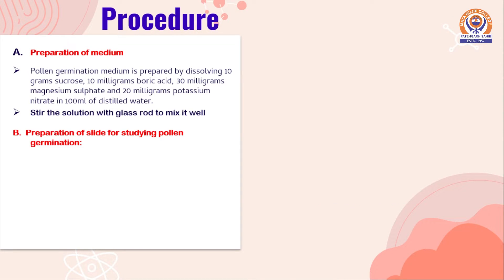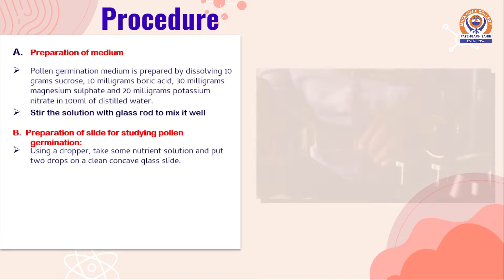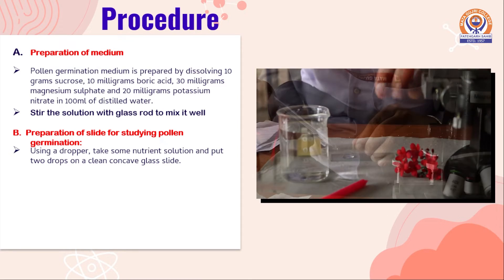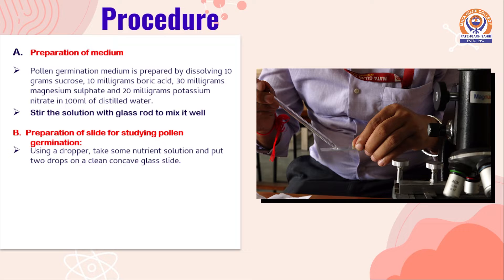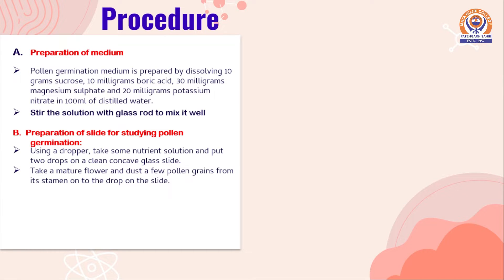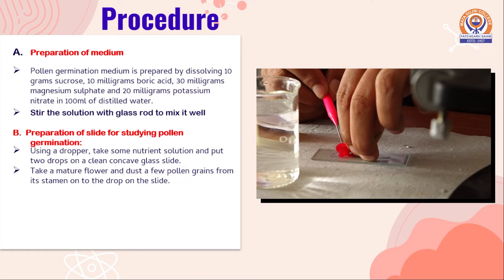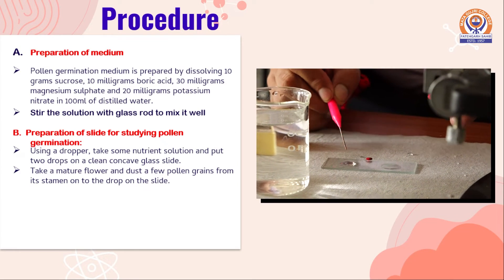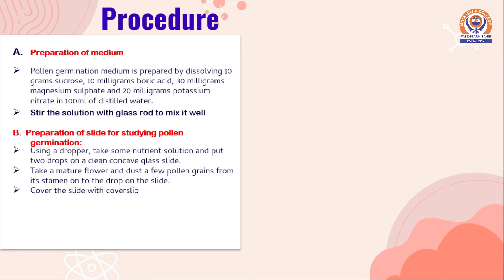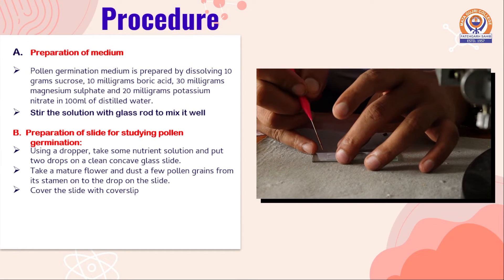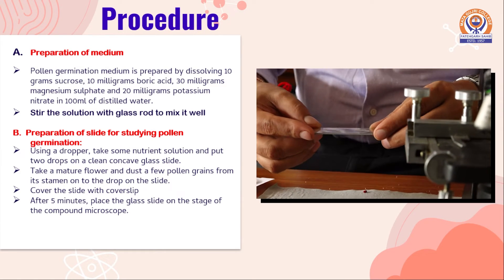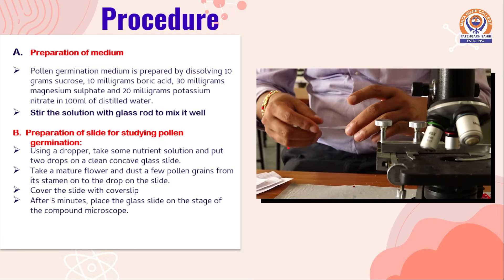The second part includes preparation of the slide for studying pollen germination. Using a dropper, take some nutrient solution and put two drops on a clean concave glass slide. Take a mature flower and dust a few pollen grains from it onto the drop on the slide. Cover the slide with a cover slip. After 5 minutes, place the glass slide on the stage of the compound microscope.